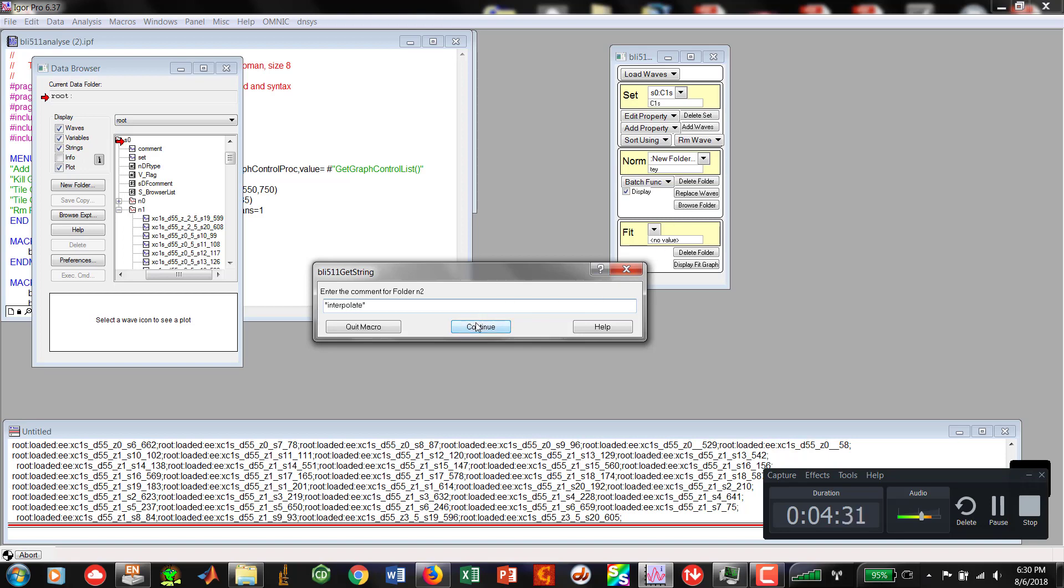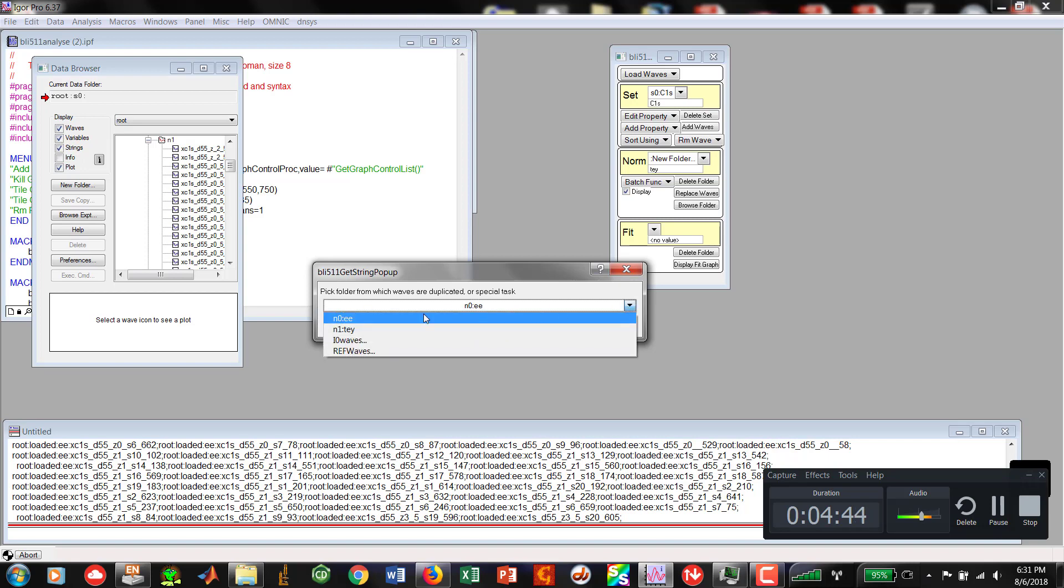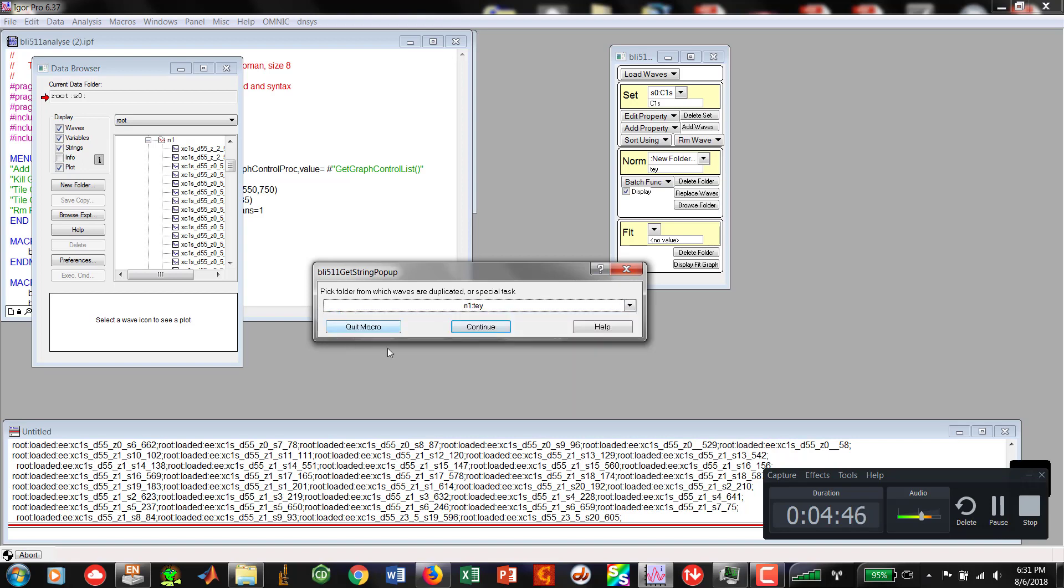Interpolate. Now this is where we are going to merge the X and the Y waves. Hit Continue. Pick folder from which waves are duplicated or special task. At this stage, it doesn't really matter. We're going to go N1 TEY.